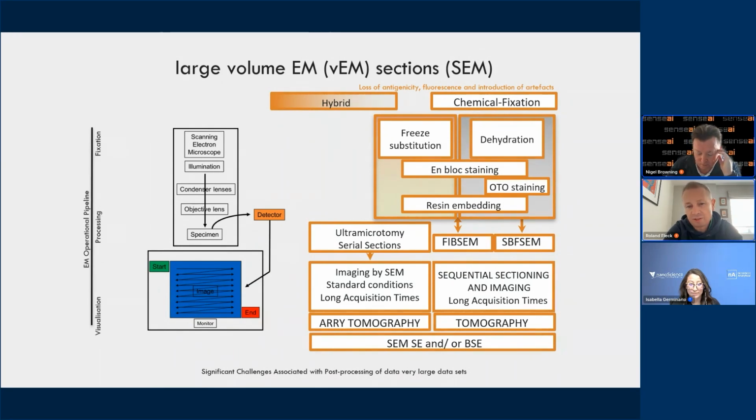Okay, so a lot of the challenges just come down to the sensitivity of the sample itself to beam damage. That's particularly prevalent in the cryo environment, but also exists in the room temperature environment. A lot of your preferred sample preparation approaches, your high pressure freezing, freeze substitution into resins tend not to be compatible with techniques like serial block face scanning electron microscopy, because the resins are quite sensitive to beam damage, and this makes it a little bit limiting. In the case of the cryo environment, they're extremely sensitive to beam damage. Basically, you can devitrify or melt your sample in the crudest sense.